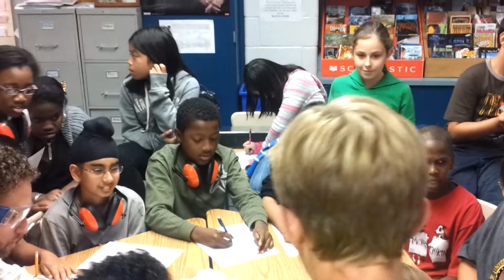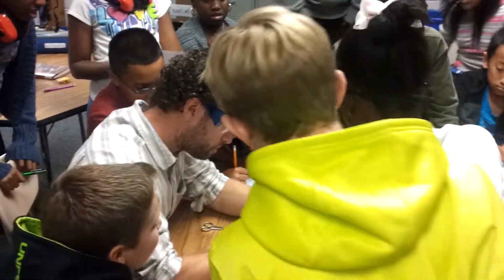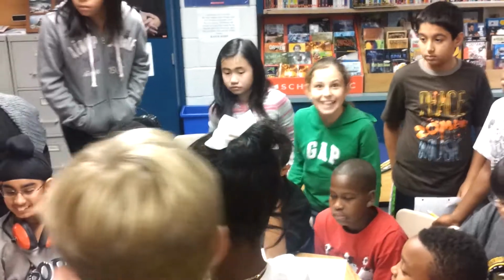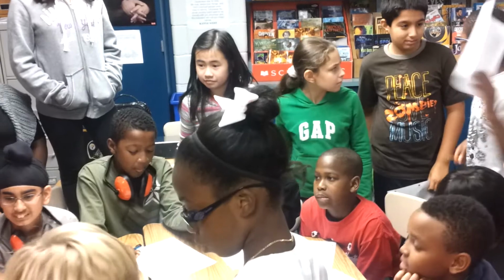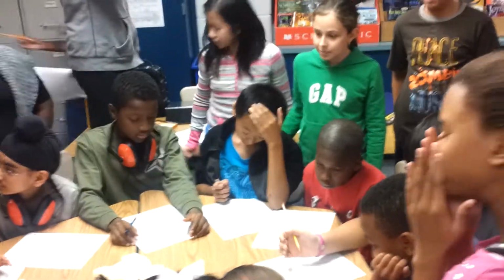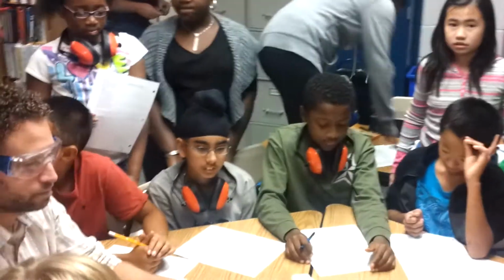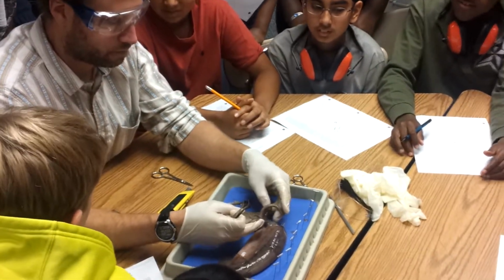Abby? Pull out the beak. Use the tweezers to explore the middle of the tentacle. Back up. Sit down. 3, 2, 1. I know it's exciting, but hold on. I'm going to ask Abby to read that one more time. Please don't interrupt. Go ahead, Abby. Pull out the beak. Use the tweezers to explore the mouth of the squid, which is in the middle of all the tentacles. Pulling out the beak requires a lot of pulling.